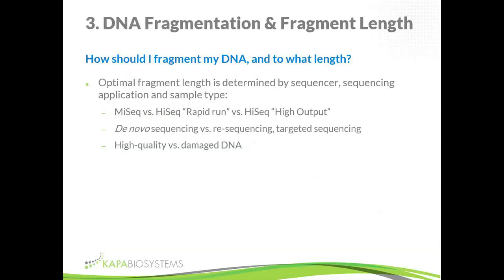And then high quality versus damaged DNA, we talked about that a little earlier. FFPE DNA, for instance, the molecular damage is of such a nature that, although we can fragment DNA into large pieces, we can't utilize large pieces through any of the amplification steps of the process. And so rather fragment your DNA short to have a better statistical ability of getting as many unique fragments into your sequencing run, sequenceable in the end.